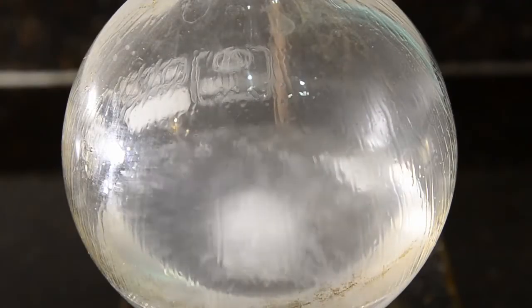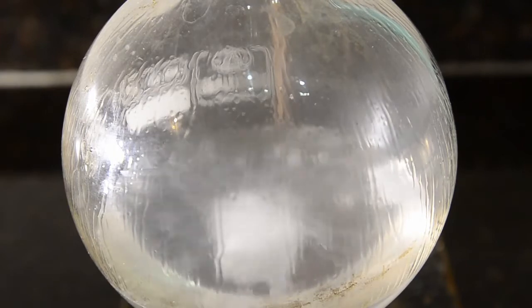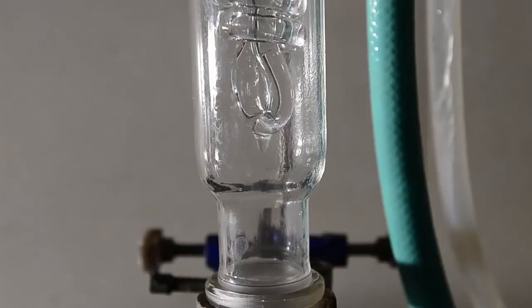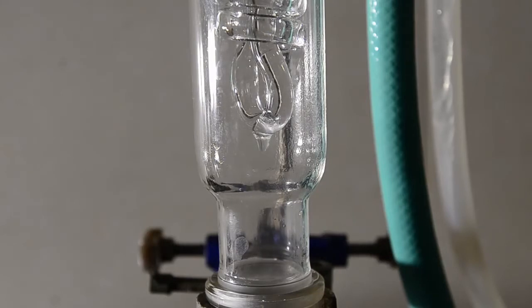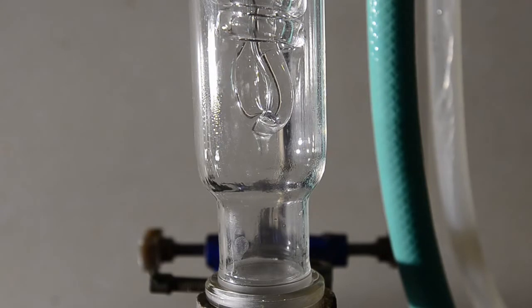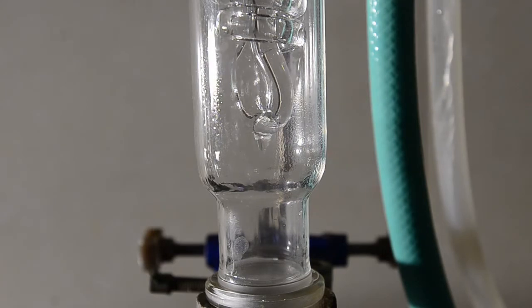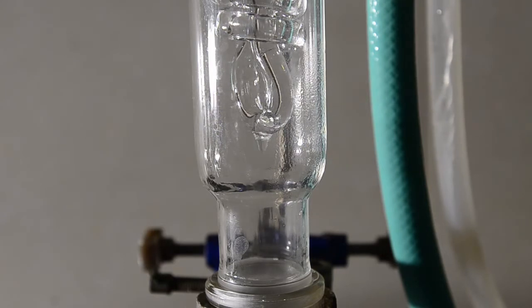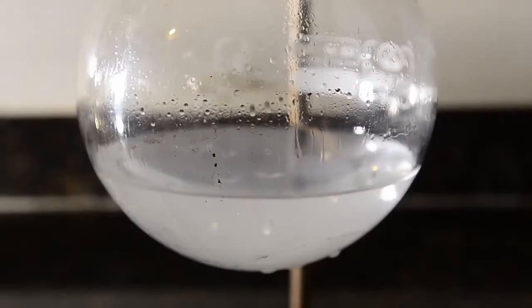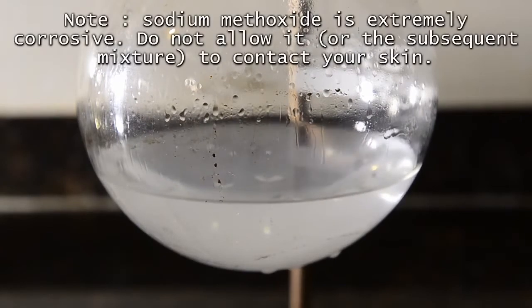Within a minute or two the methanol will get hot and start to reflux slightly in the flask. The sodium metal takes between 5 and 10 minutes to dissolve completely. Just allow the mixture to reflux and wait until it has all reacted. Nearly there now. Here's our hot sodium methoxide solution.